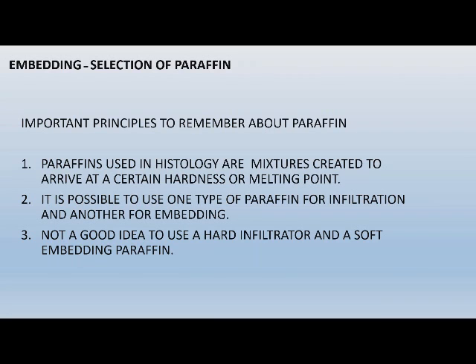And it's very possible, and probably many of you do this, you use one type of paraffin for infiltration and another for embedding. It's not a real good idea to use a hard infiltrator and a soft embedding paraffin. The wonderful thing about this, though, is that the vendors who produce and provide two types, one for embedding, one for infiltrating, will give you the right types, so you can't mess it up and it'll work well for you.